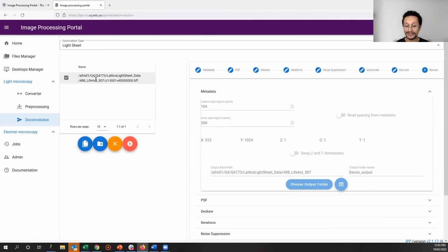I was wanting to ask, can you save that template so that you could run the job automatically straight off the instrument, so to speak? If I was to say to someone, hey, here's my sample, can you run it, and here are the parameters I actually want to run. Do you know that sort of thing beforehand, or does it depend on the acquisition that you might change some of these parameters? Or if you're relying on a biologist for doing the same thing over and over, it could be dangerous.